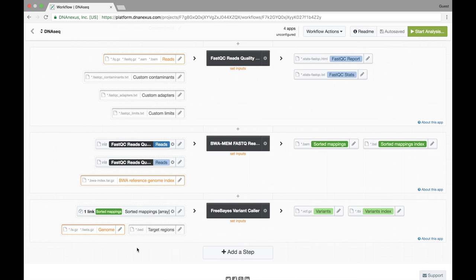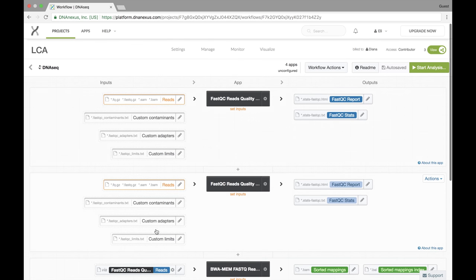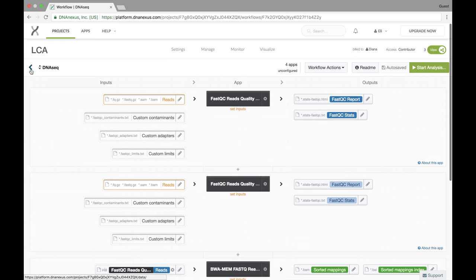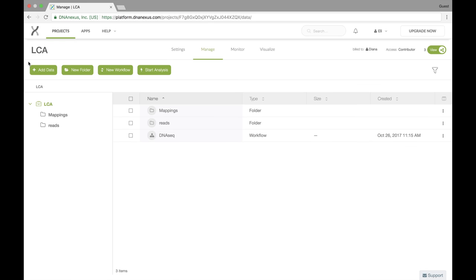So that wraps it up for creating our workflow template. Let's make sure this is saved, which it is, and let's go back to our project. Alright, so now we've closed and saved our workflow template.